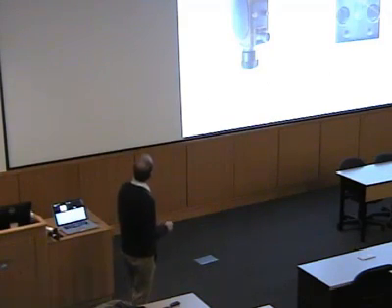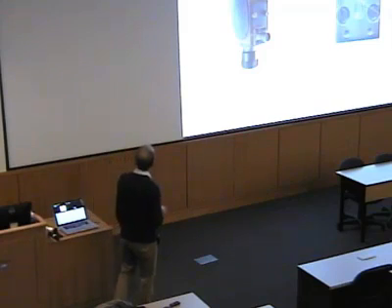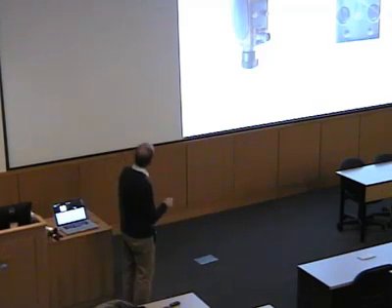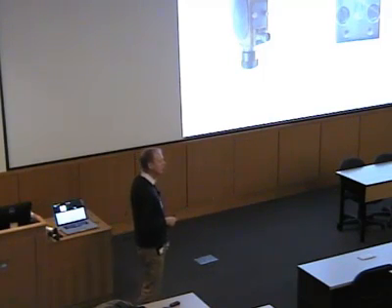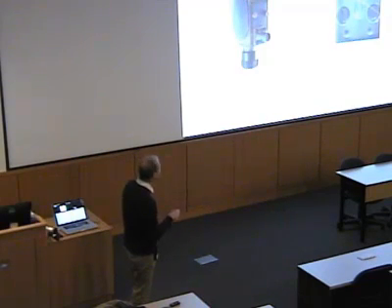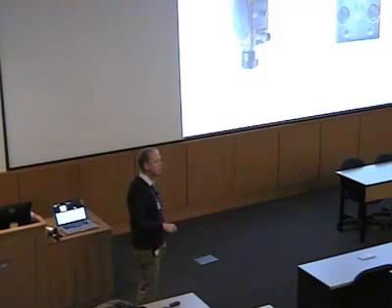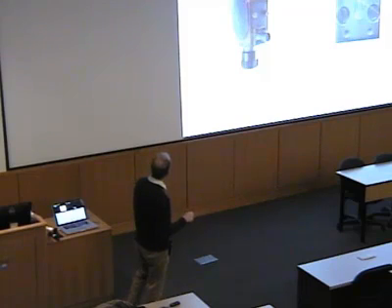Here's a picture of a resonator made by Bruker, the main producer of EPR spectrometers. You can see here at the back there's a metal tube. This is a waveguide. Microwaves are in a funny region of the electromagnetic spectrum. We can't transmit them easily through a cable, because the impedance is much too high. On the other hand, if you try to transmit them through free space, they diverge very broadly. But if you use a waveguide, which is basically a metal tube, then it's easy to transport them to the resonator. In any case, we have our resonator, our metal cavity.